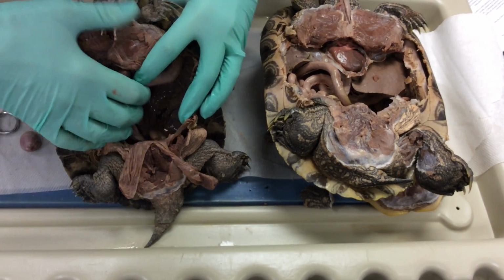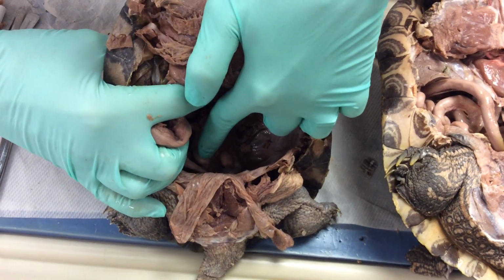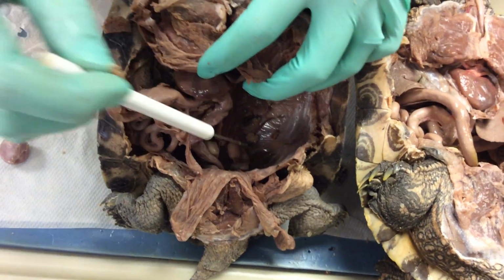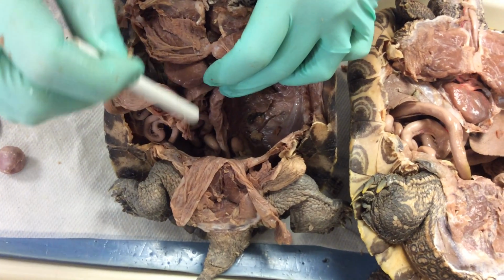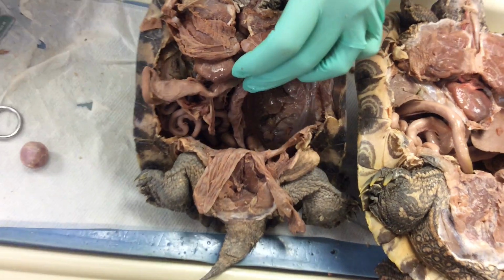Alright, so if we're looking inside, these two balls, those are actually the testes, and then this structure right next to it, those are going to be the kidneys. So we have the kidneys down here and the testes right here. And again, it happens on both sides. So this is the colon right here, testes, and kidneys directly behind it.